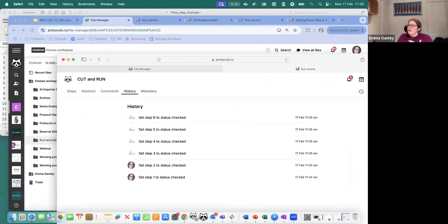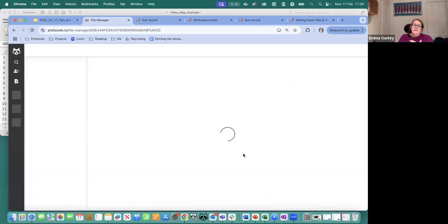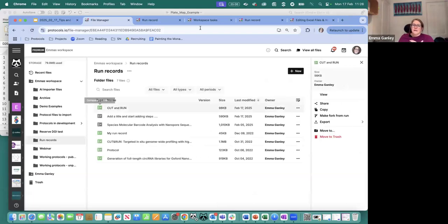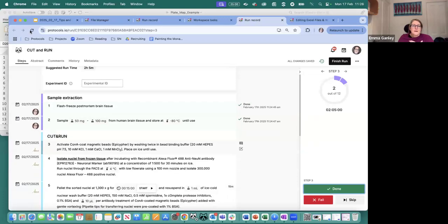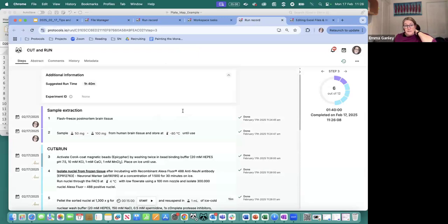So, all right, I'll go back to being Emma. And it's not updated here, but if I refresh, you'll see that now is green. That one's completed. It's done. And we were in here. I think that's not updated either. So we just need to make sure I'm on the latest version of it. And you can see everything that was done and who did it.